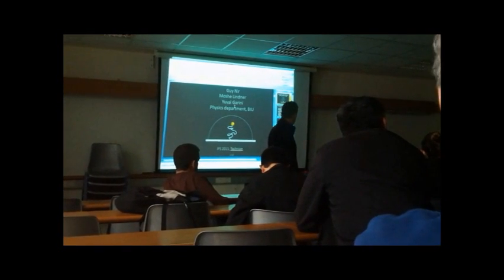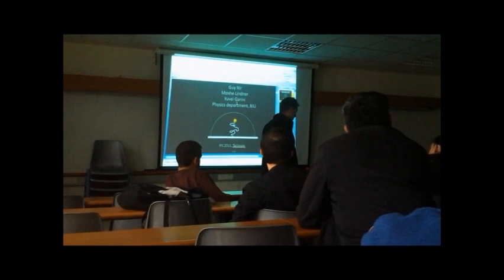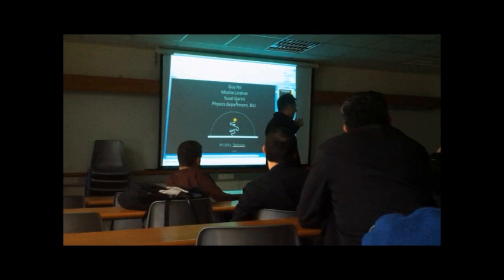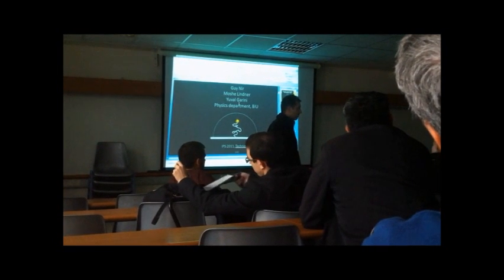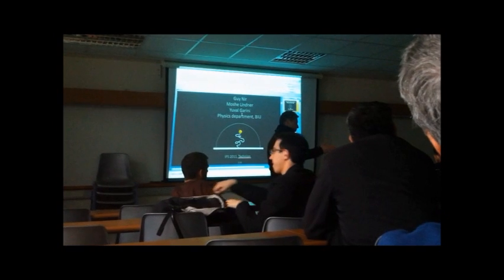Is this video, correctly? We use the CCD. We just do a not-video, because we take a set of pictures at every time spot. What is the rate? We use 100 hertz to 300 hertz.